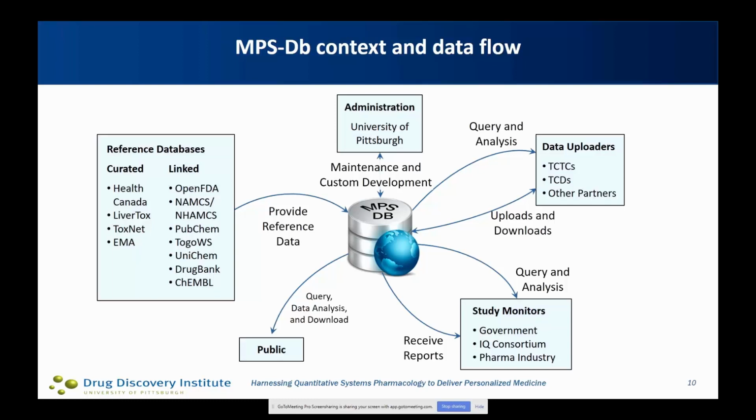There's a series of users. What's on the right-hand side is referred to as data uploaders. Really, they're more than just uploaders. They're data uploaders, data reviewers. The data that they provide to the database is managed and controlled by those data providers.